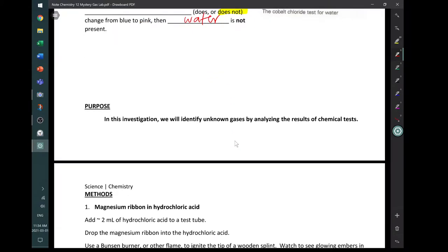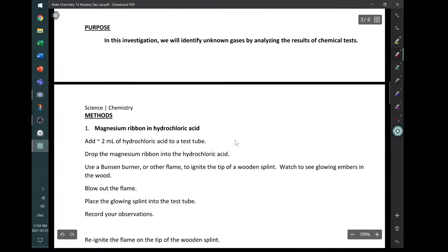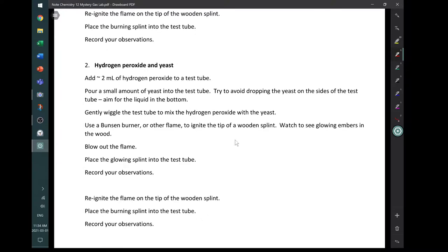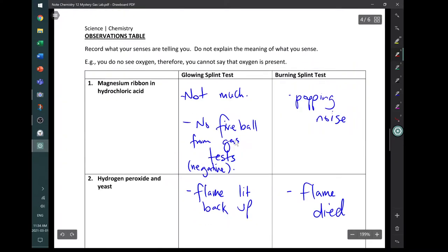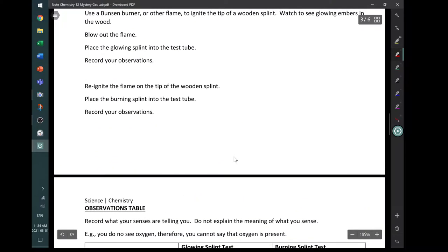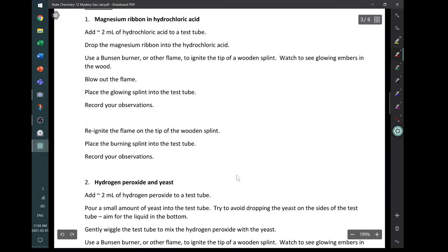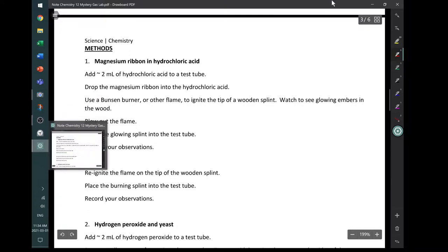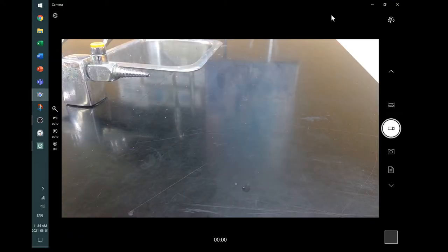Now, our purpose in the investigation is to identify unknown gases by analyzing the results of chemical tests. So we're going to do a few tests here. It's a good idea to pause it and read through the instructions yourself. I'm going to read through the instructions as I go through the actual demonstrations of the two tests. We're going to do this magnesium ribbon and hydrochloric acid, then hydrogen peroxide and yeast. And there's a place to record your observations. So you want to grab that so that you can record your observations.